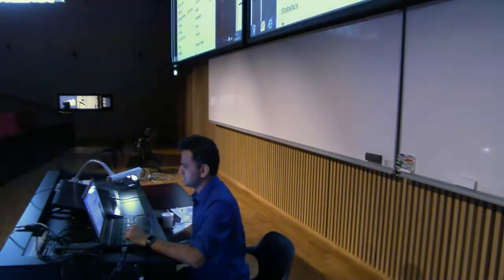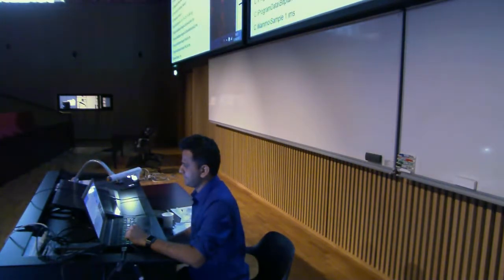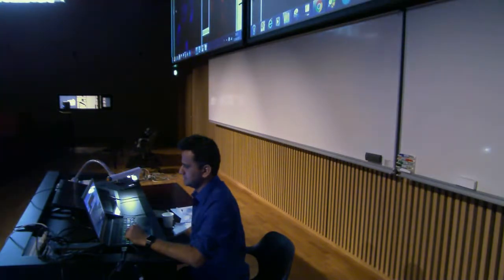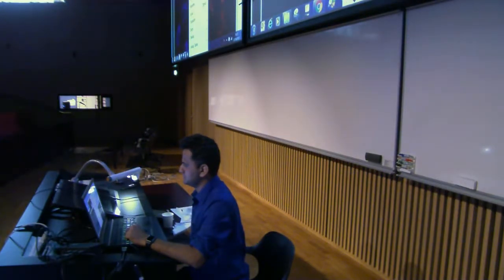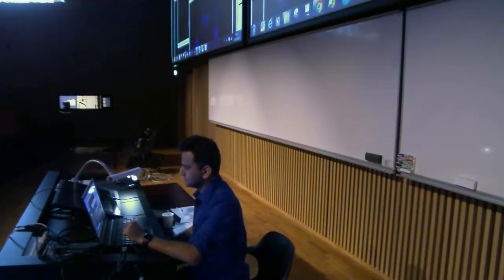Image and then Stack and make a montage. Okay, I don't know why it's not appearing. Image, Type, RGB, this is RGB, okay, it should work. I don't know why it's not.